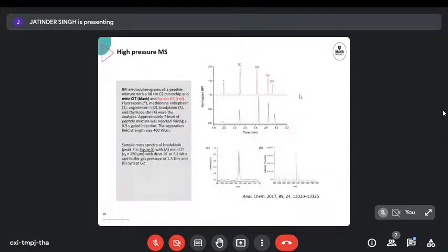First, they validated the mass spectrometer. So there's, again, the long capillary electrophoresis chip using a normal mass spectrometer. And so the mini CIT. I'm trying to think which one was which. The higher peak intensity was the commercial instrument. So this is a commercially available mass spec. This is the chip-based mass spectrometer.